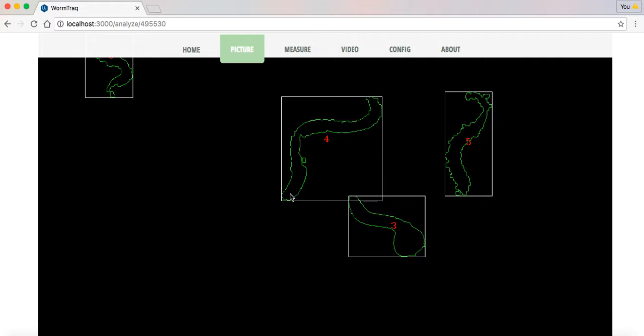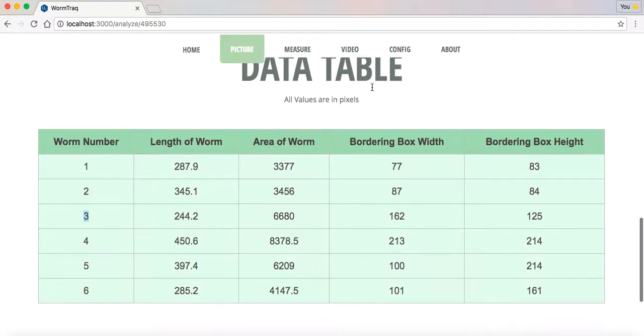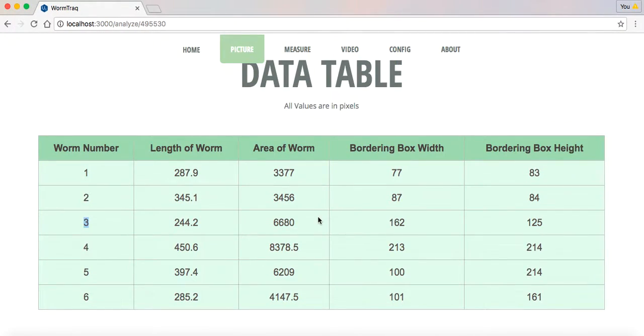So like here's 4, pretend that little line drawer goes right through the midline, something like that. That would be a midline measurement. I label it as length. Maybe I should change that.